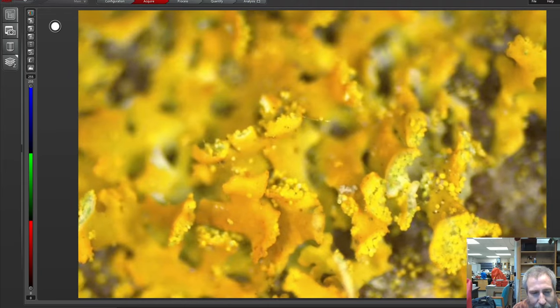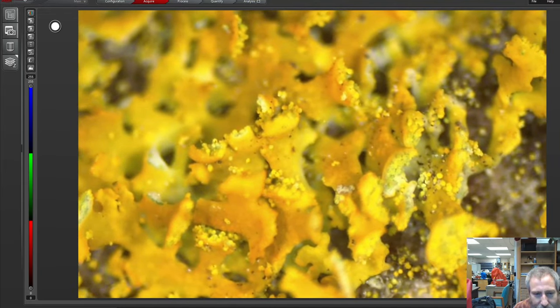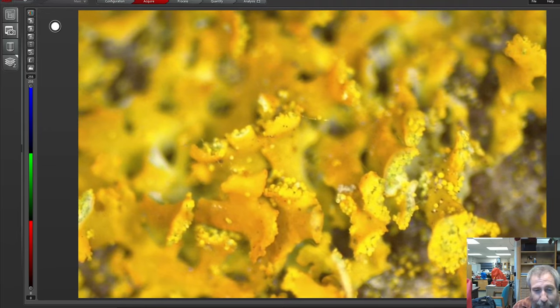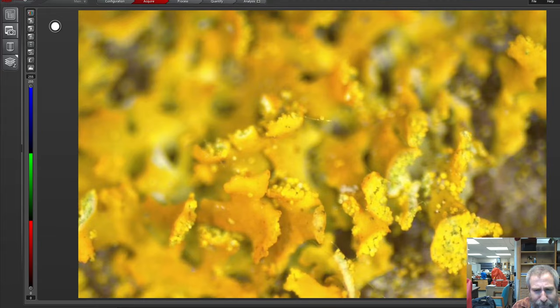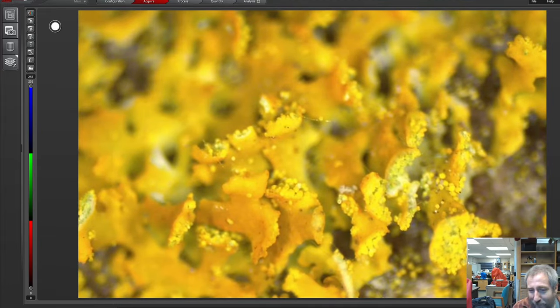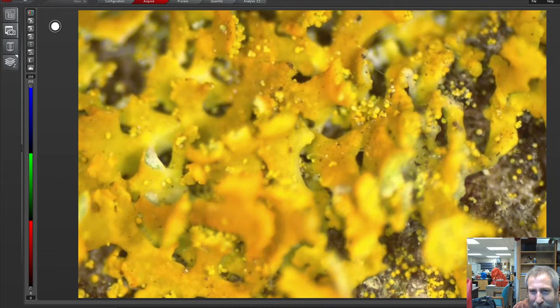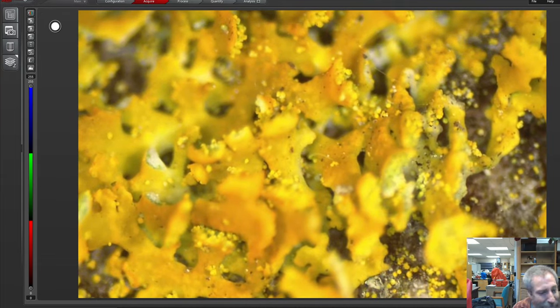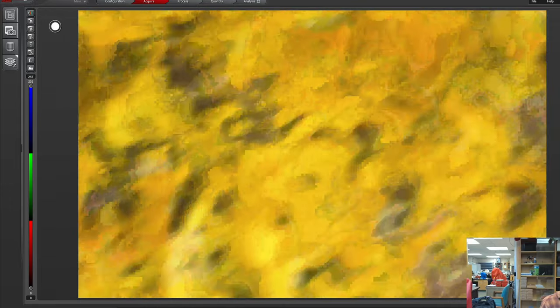I think the sidewalks have a lot of lichen on them, just like little bits of it, and people don't realize it until you start to look really closely at the sidewalk. I would take a piece of the sidewalk and put it under the microscope, but it turns out the university frowns on me out there with my rock hammer smashing the sidewalk. So, oop, there's a little mite. There he is. He came crawling in and out of our field of view. He's like, why is it so bright in here all of a sudden?